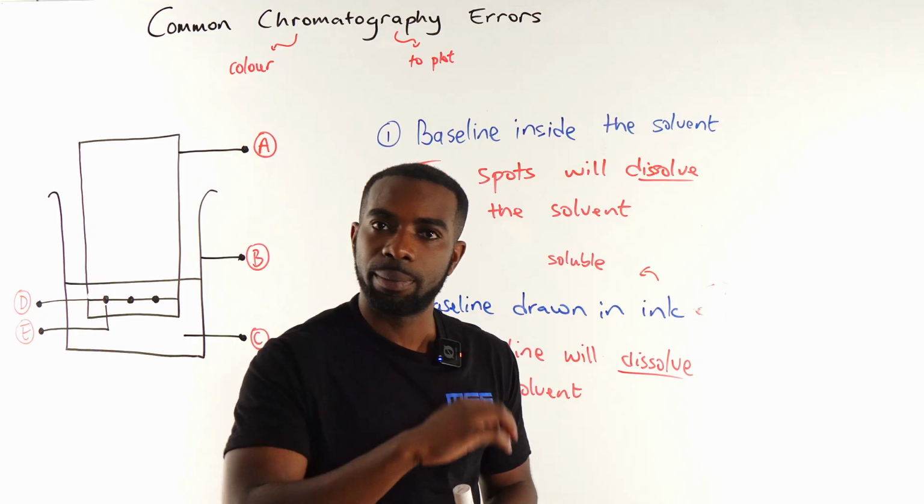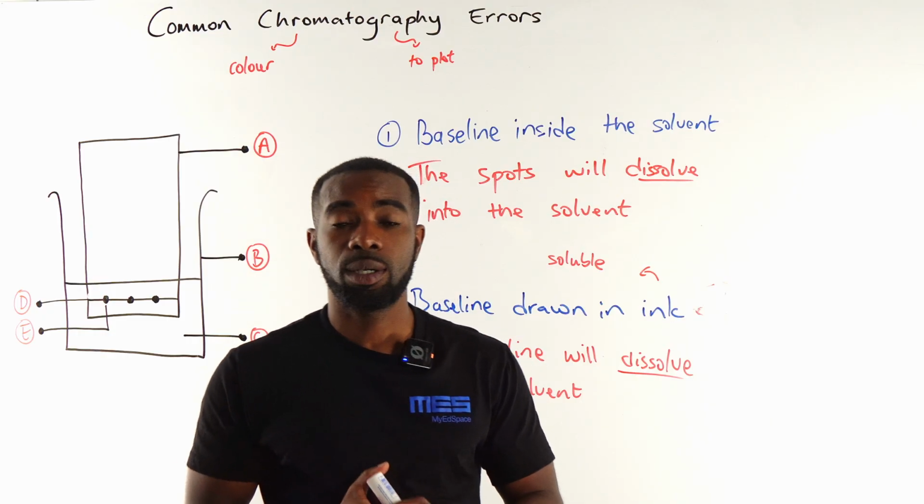So hopefully, looking at all of this here, you are able to spot the common errors associated with chromatography. Always remember the word dissolve, and also hopefully you are clear on how it works.